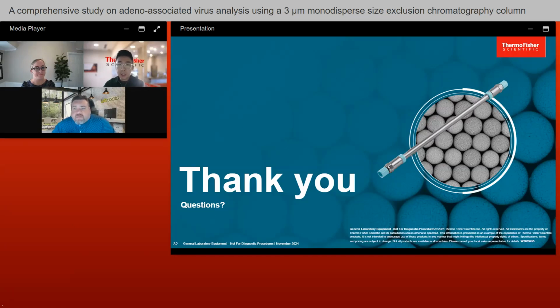So I would probably not say less sensitivity, but SEC-MALS typically does require larger sample injection volume. I think based on the detection method itself and the comparison of the new column with a very popular column option from vendor W, we see no sensitivity difference or worse sensitivity at all.